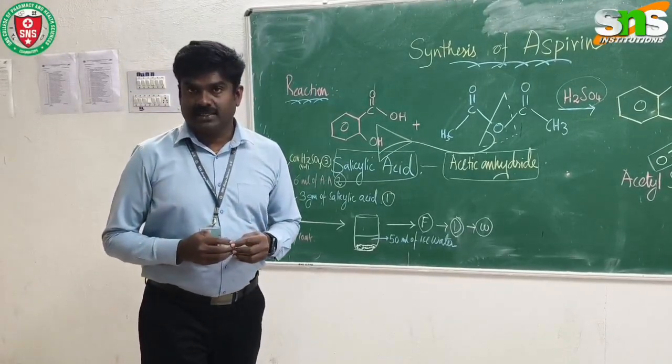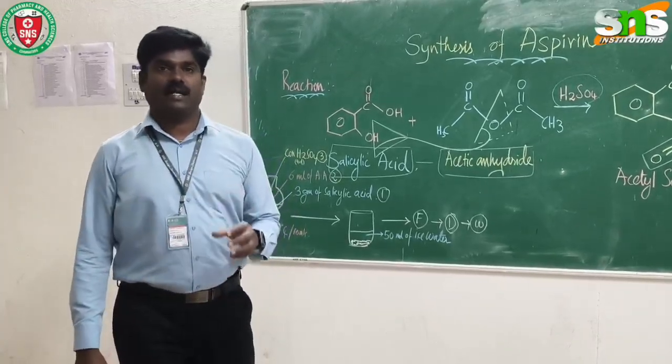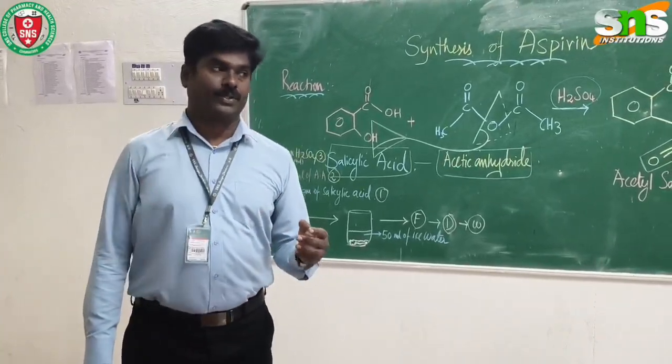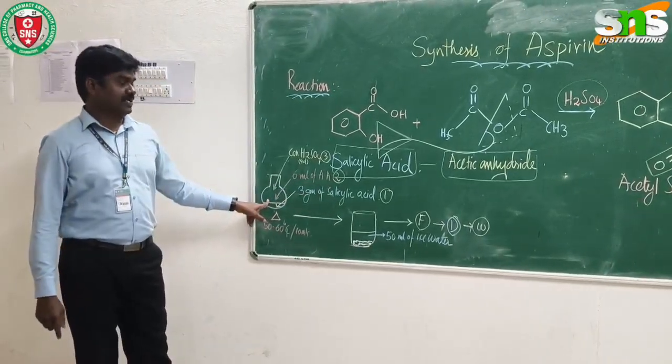We have to measure exactly 6 ml and transfer it into the round bottom flask.